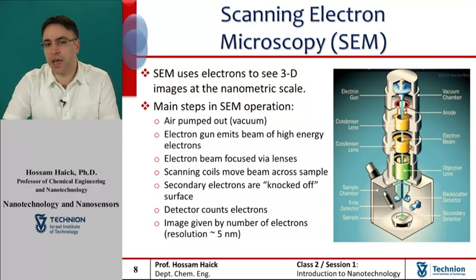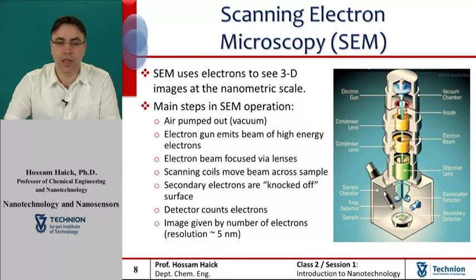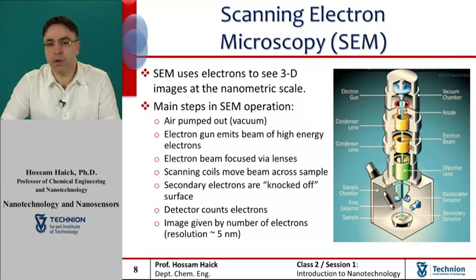In a typical SEM, an electron beam is thermionically emitted from an electron gun, such as a tungsten filament cathode. The electron beam, which typically has an energy ranging from 0.2 kV to 40 kV, is focused by one or two condenser lenses to a spot about 0.4 nanometer to 5 nanometers in diameter.